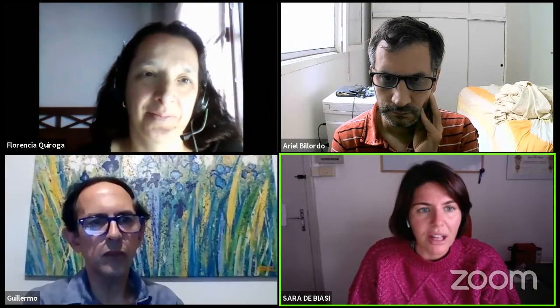No, I mean, if we see this kind of batch effect, one thing you can do is to normalize. You can try to use Cytonorm that Sophie Van Gassen published, I think, last year or 2 years ago, and try to normalize and rescue the values affected by batch effect. Or otherwise, if the batch effect cannot be removed, you have to avoid using the marker affected by batch effect. But batch effect is very annoying. You can lose a lot of data because of batch effects.